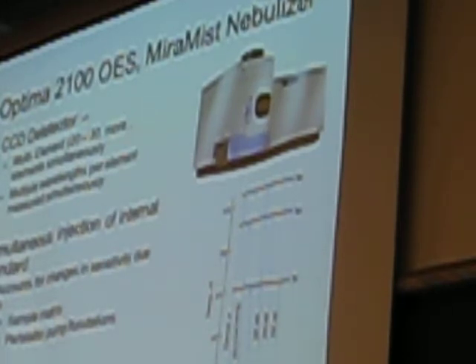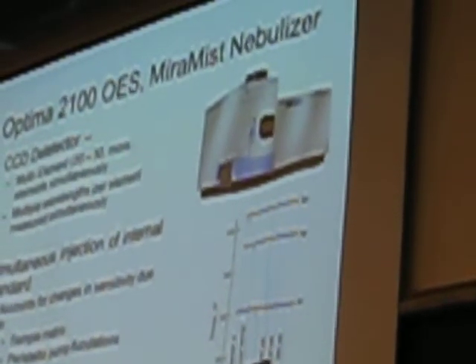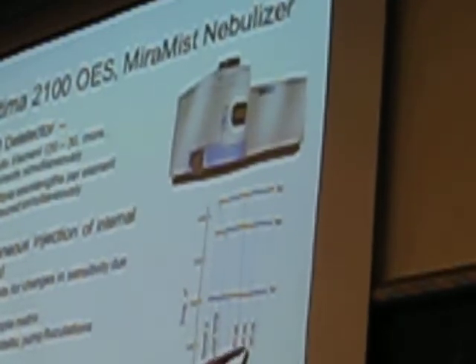You can measure multiple wavelengths per element. And so for one atom, like sodium in this case, you're going to get multiple emission spectra from that, depending on what excited orbital electrons are falling back down to the ground state. And you can measure the emission spectra simultaneously. So you can measure 3 different emission lines for sodium. And you can calculate the concentration of sodium atoms compared to your standards from each of these emission lines and then see how well they agree. And then you can average across all 3 emission lines.